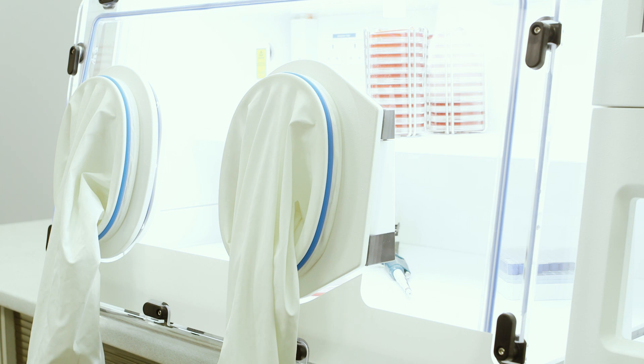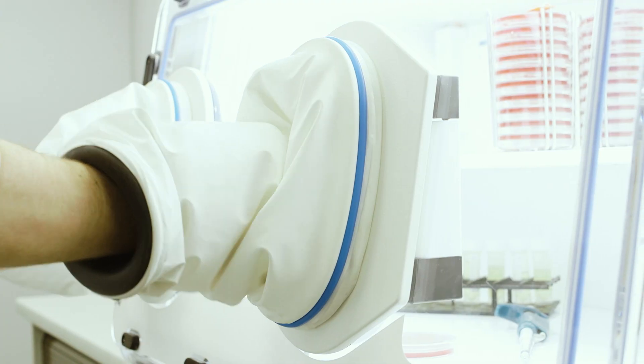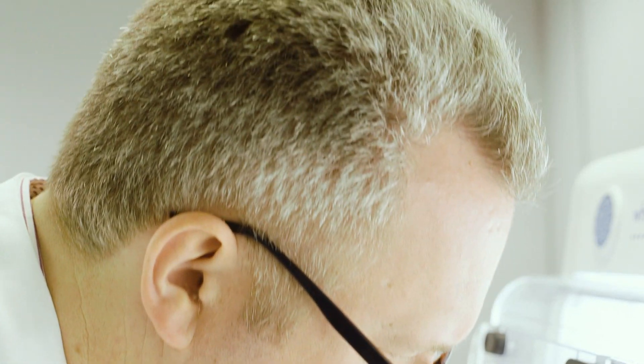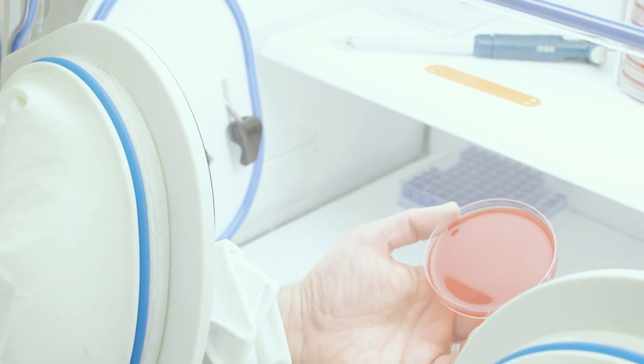Our patented oval portholes provide the user with an ergonomic solution for workstation access. These portholes, combined with flexible sleeves and cuffs, provide maximum comfort for operators who use a workstation for long periods.